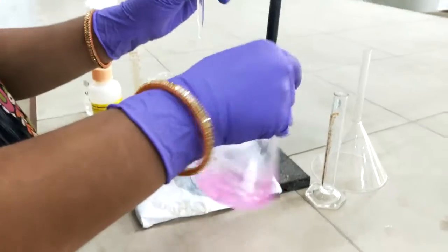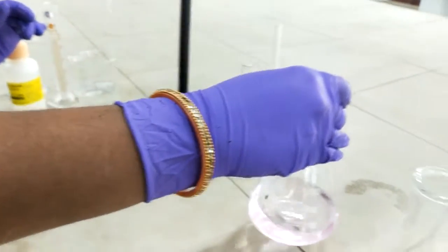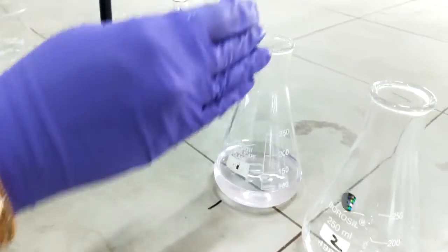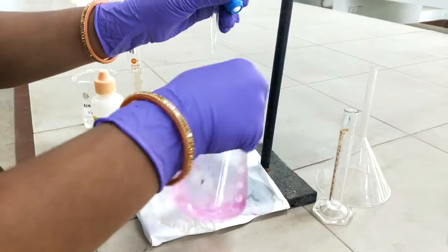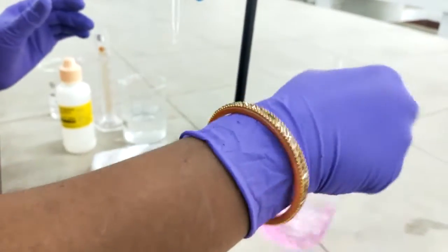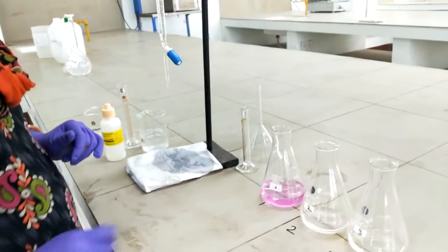So appearance of permanent pale pink color is the end point. So now we have the permanent pale pink color. You can add one more drop. Okay, please note down the reading, volume of NaOH consumed.